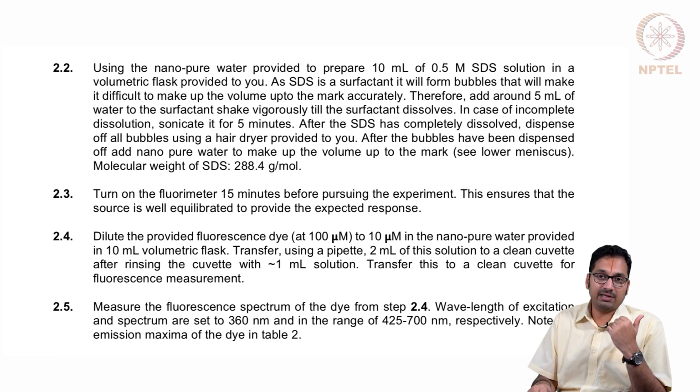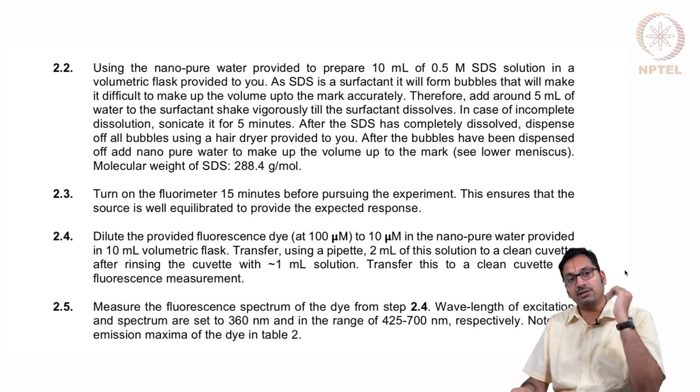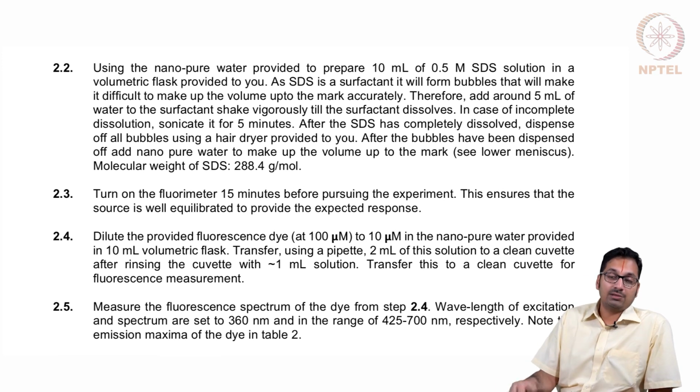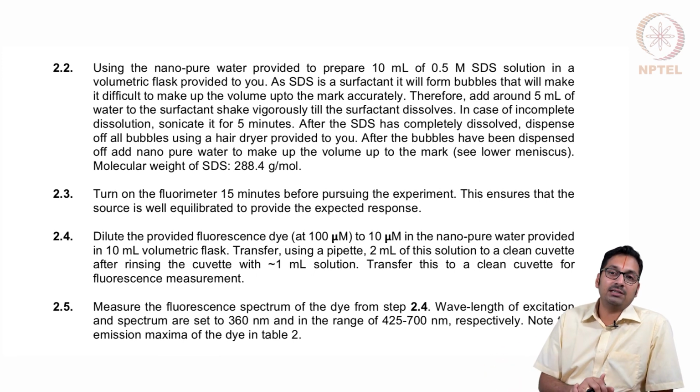One other variable that we have set there is slit width, one has to be careful how the points are digitized so that the maxima is carefully determined. So what you are able to realize that all this could result in a systematic error, and let's assume that you have done an experiment such that everything is calibrated including your pipettes and your weighing balance. You are trying to minimize the systematic errors that could come up, where only finally the random errors that are associated with the measurement itself would result in small standard deviations that would end up coming.